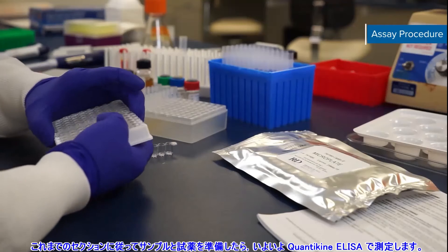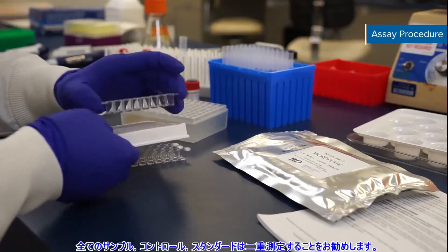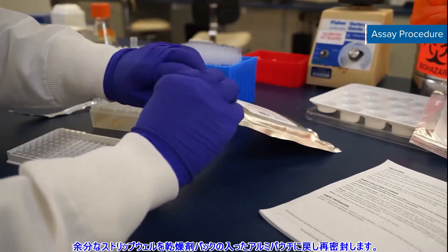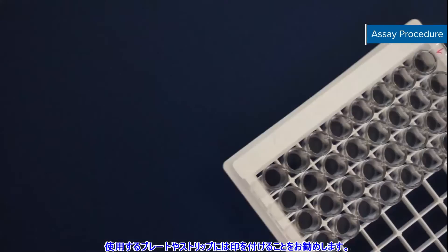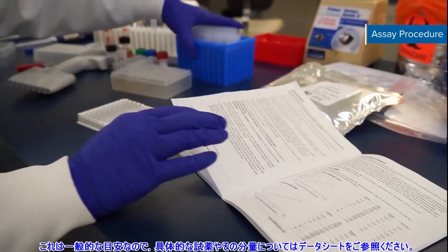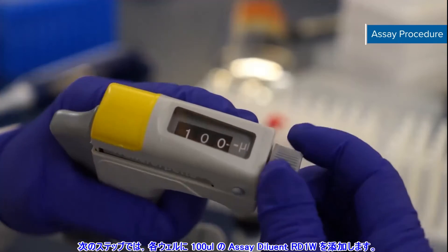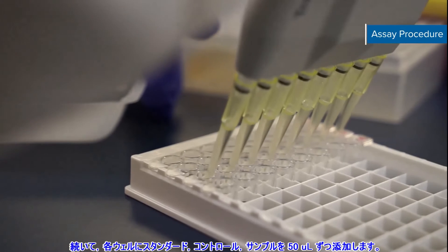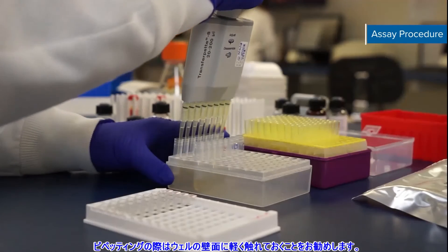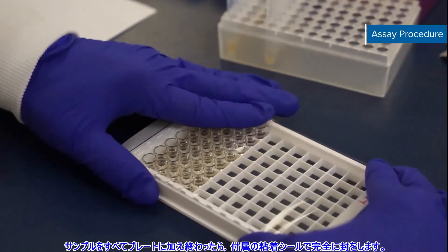Once you've prepared your samples and reagents as directed in the previous sections, it's time to run your Quantikine ELISA. We recommend that all samples, controls, and standards be assayed in duplicate. Remove excess microplate strips from the plate frame, return them to the foil pouch containing the desiccant pack, and reseal. We recommend labeling the plate strips. Remember, this is a general guide, so refer to your kit booklet for specific reagents and volumes. The next step in the assay is to add 100 microliters of assay diluent RD1W to each well. Then add 50 microliters of standard, control, or sample per well. Be consistent. It's recommended to gently touch the side of the well when pipetting. When all samples have been added to the plate, cover the plate with the adhesive strip provided and ensure it is completely sealed.